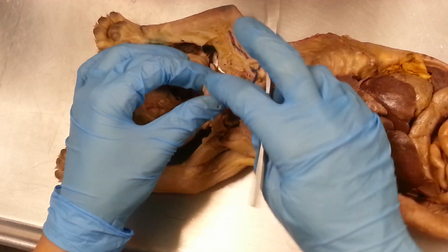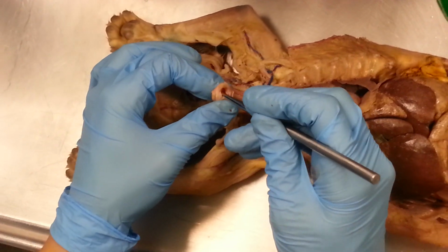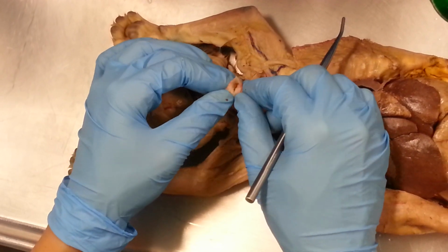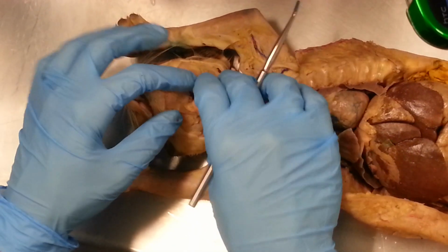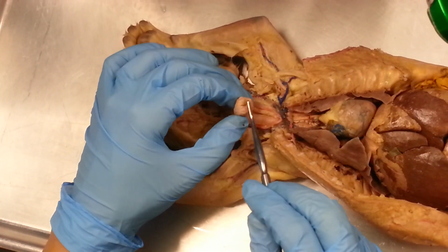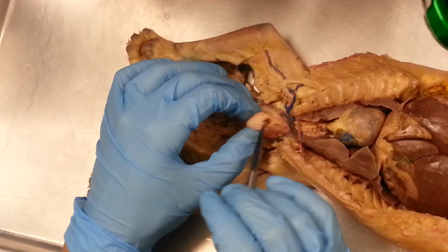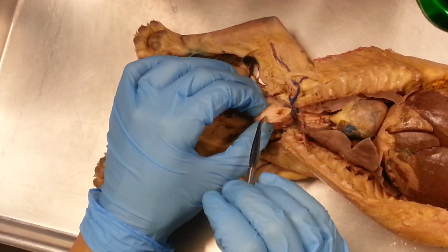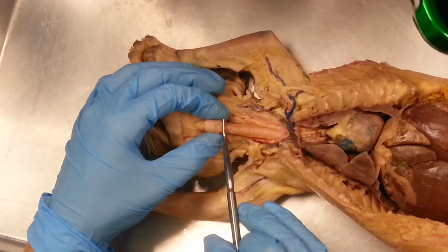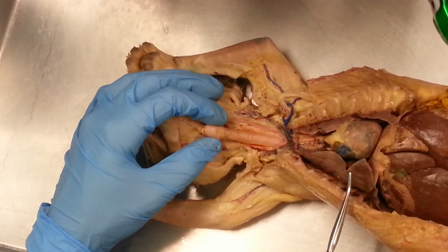In a little bit deeper from that, I can see my voice box, or my larynx, okay? If the cat were going to make a sound, that flap of skin would open or close to let sound out in different noises, okay? So this will be tucked in here. If I'm asking you on the test, it'll be pulled out, and I'll have a pin through this connective tissue, that's the epiglottis, or in here would be the glottis. If I pinned it here, you know that that's the larynx, because I'm going through to the larynx. And are there vocal cords? That's exactly right, and it's covered by cricoid cartilage. A very thick layer of cartilage is the cricoid cartilage. Okay, I think that's it.